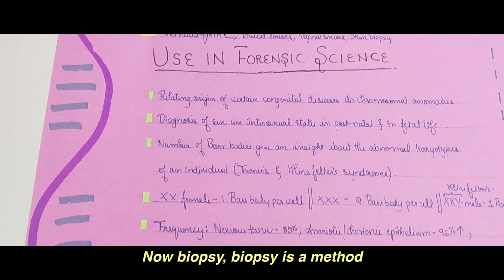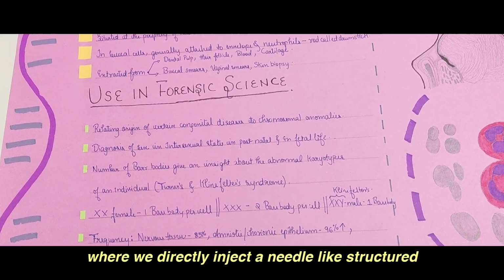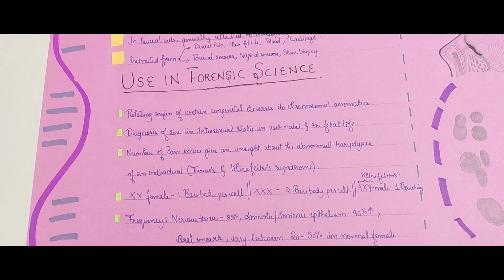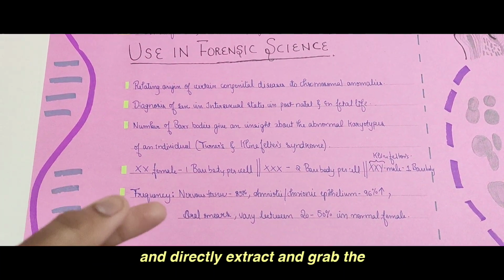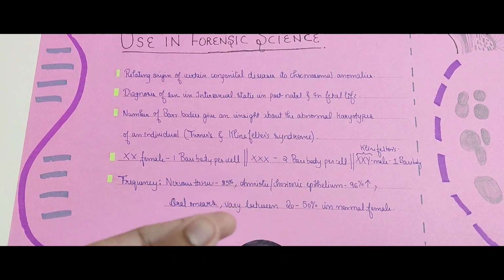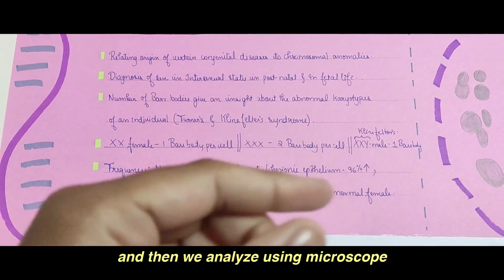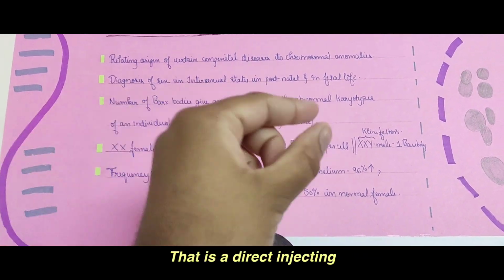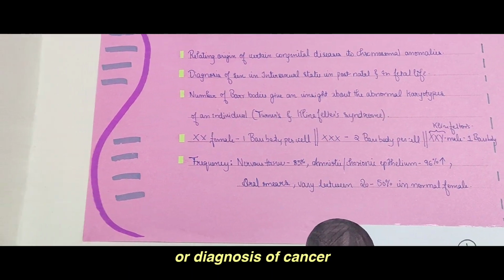A biopsy is a method where we directly insert a needle-like instrument into the flesh and extract the skin part out of the body, and then we analyze it using a microscope or other instruments. It is a direct taking of the sample, like in the diagnosis of cancer.